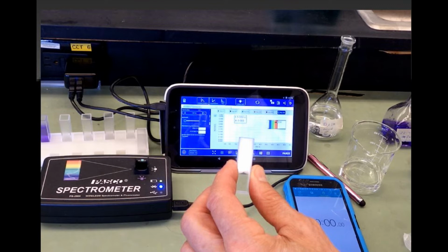So for that second solution of sodium hydroxide, you'll want to add it either with, say for example, a serological pipette that is loaded with the correct amount in the bottom, and you can blow that volume out carefully and quickly with a bulb, or preferably, and what I did, is use an auto pipette to deliver the required mLs of sodium hydroxide, and that gets the solutions together and mixed quickly.